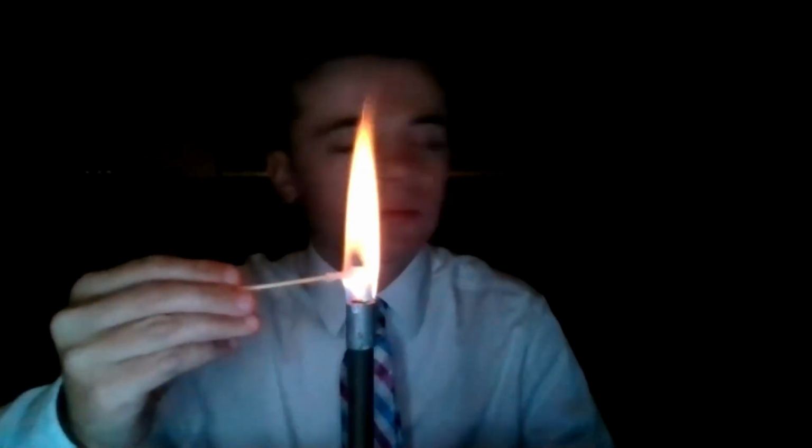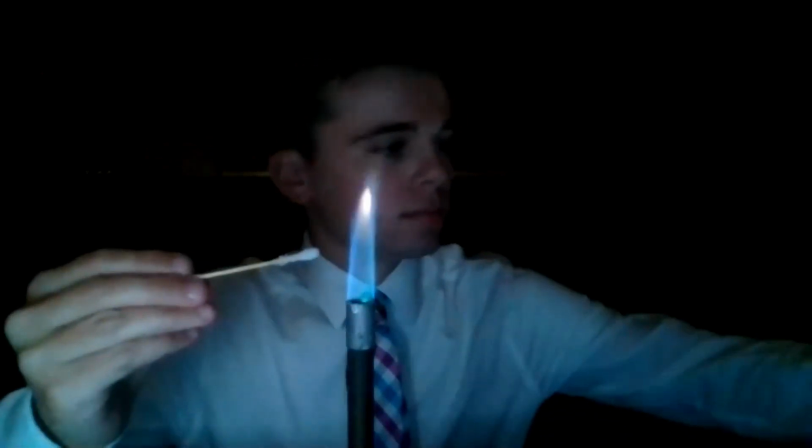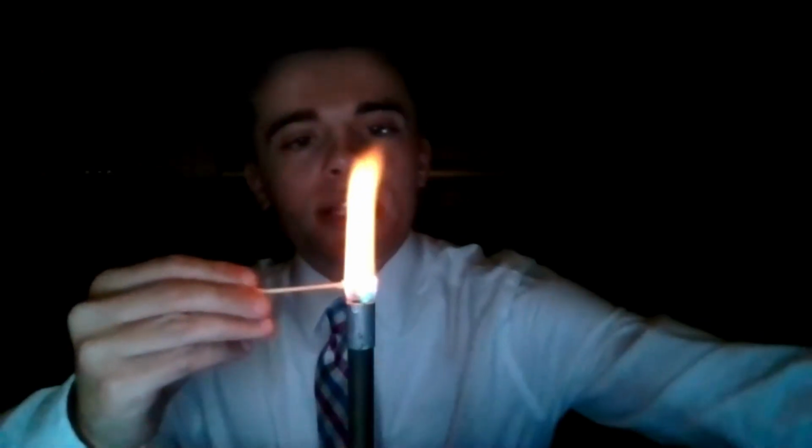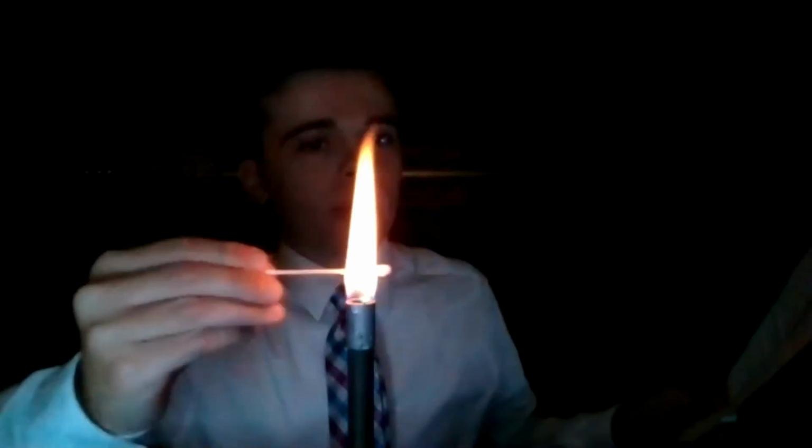So let's see. Oh, let's do this one. Then after we do this one, we will attempt to mix the colors. Okay, so this one. Nice orangey red or a pumpkin orange.